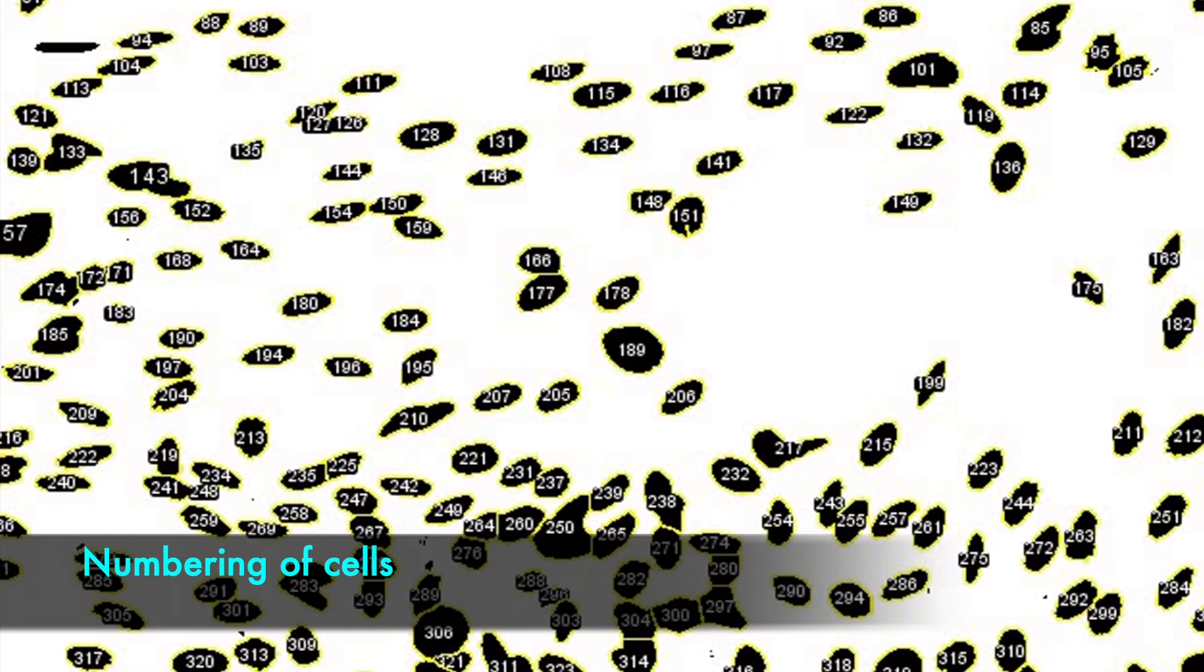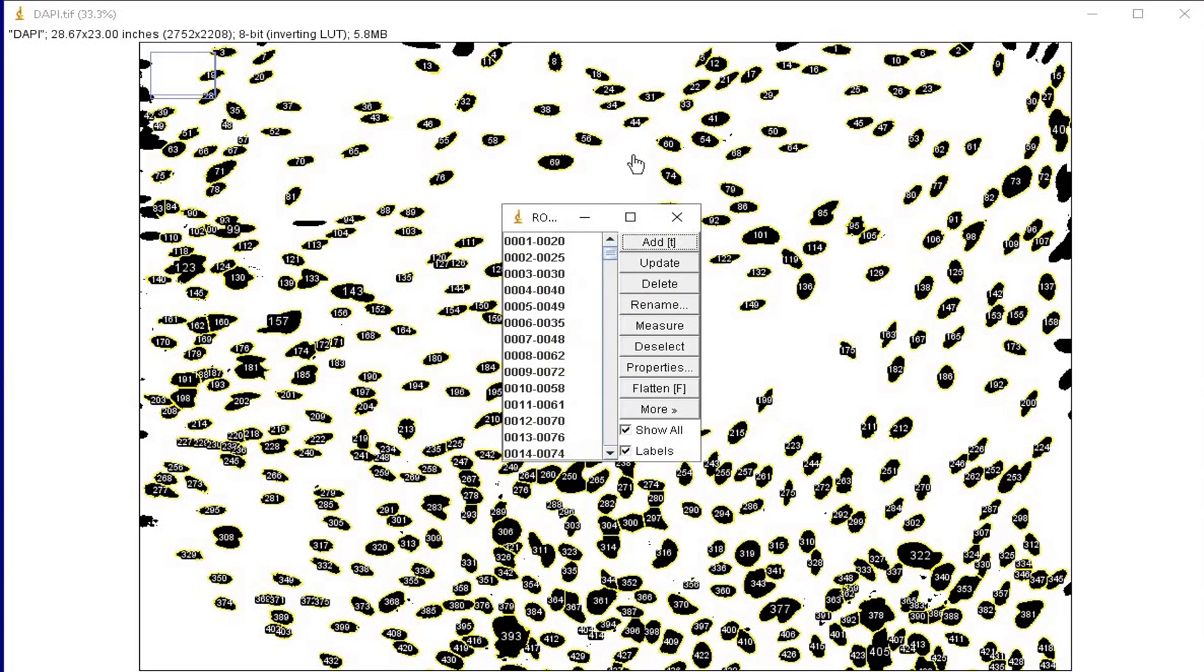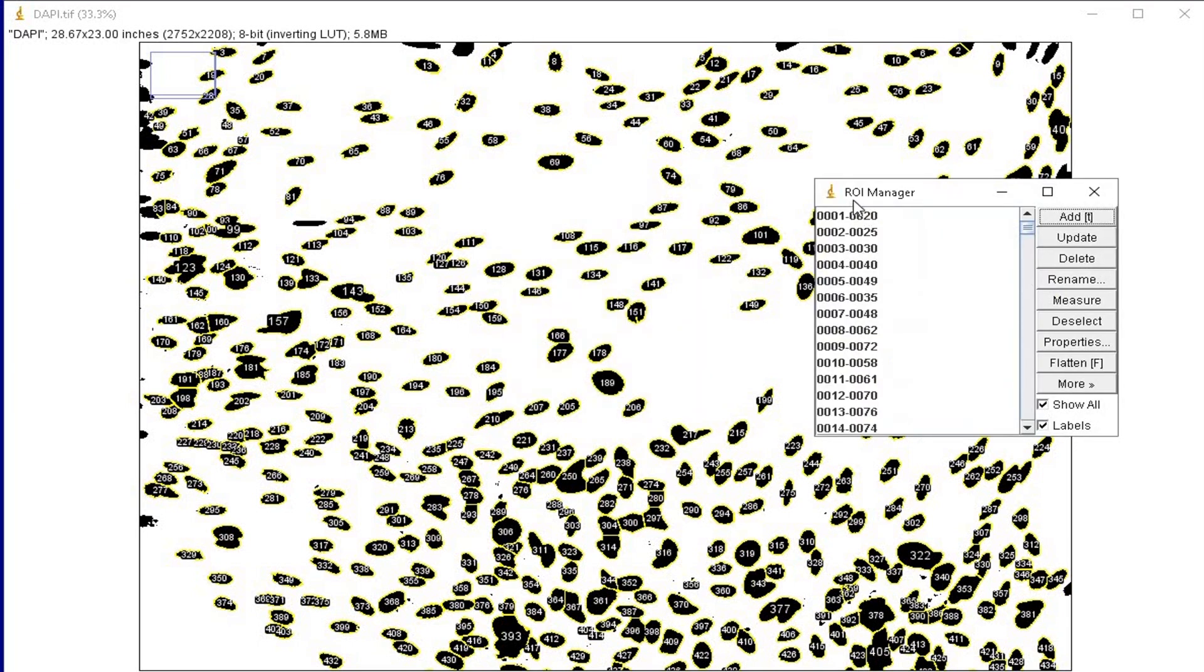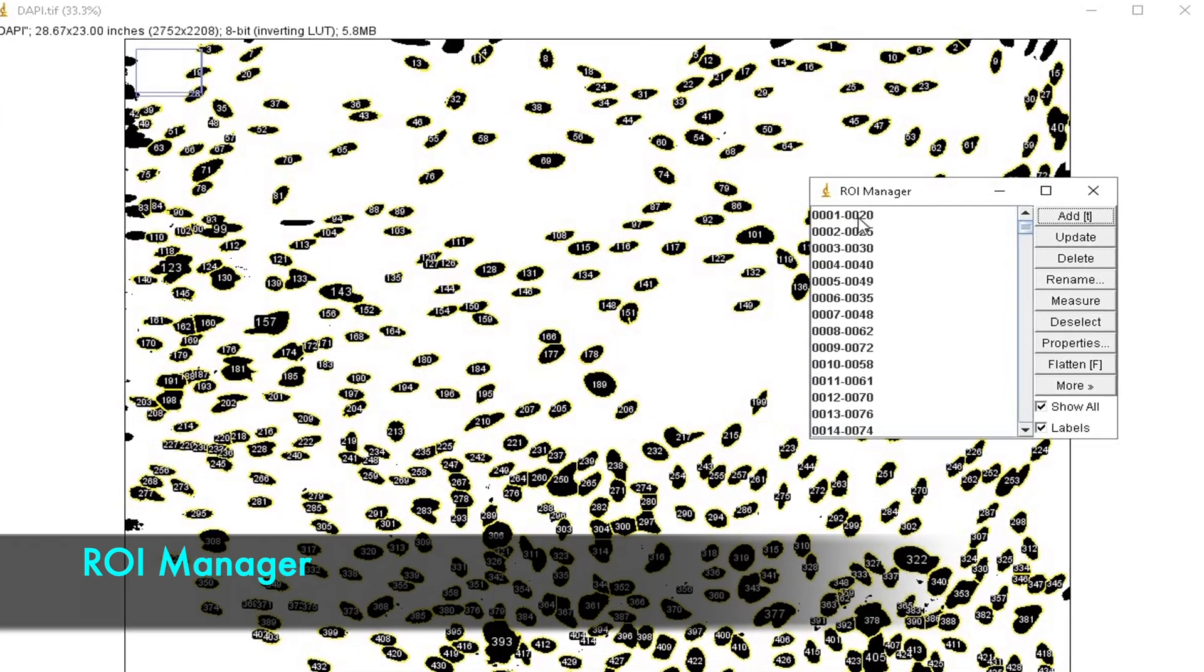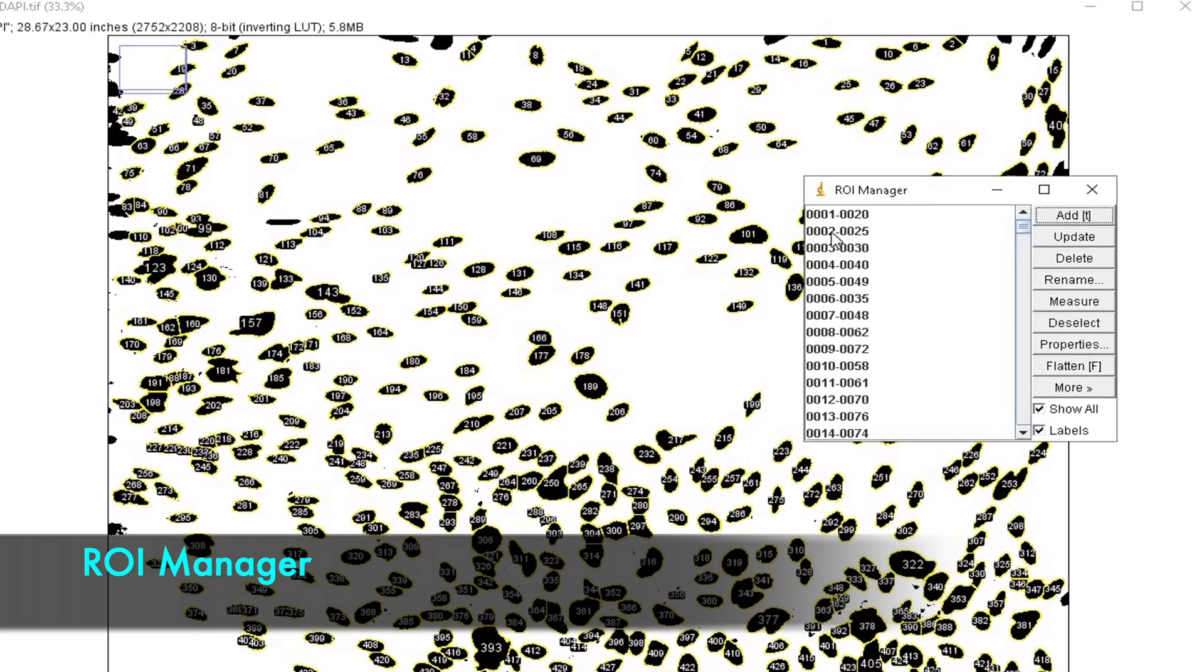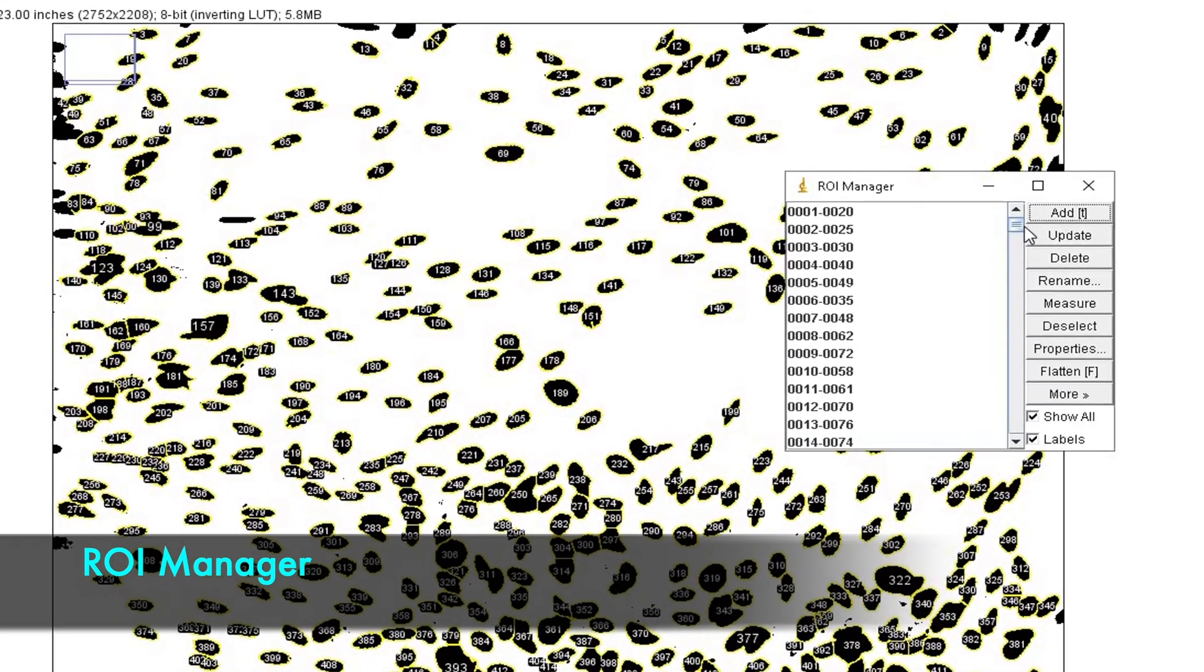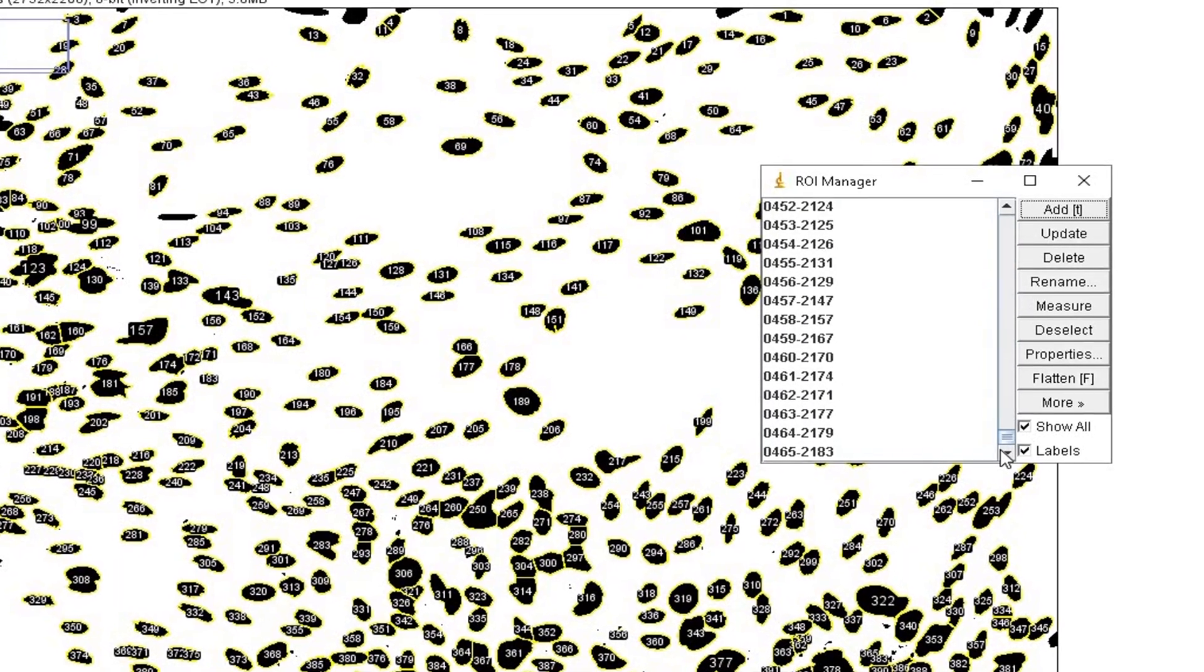The numbering of the cells is an important step since the area and the intensity will be assigned to the particular cell number. The ROI manager dialog box pops up with a list of separate ROIs, one for each nucleus.